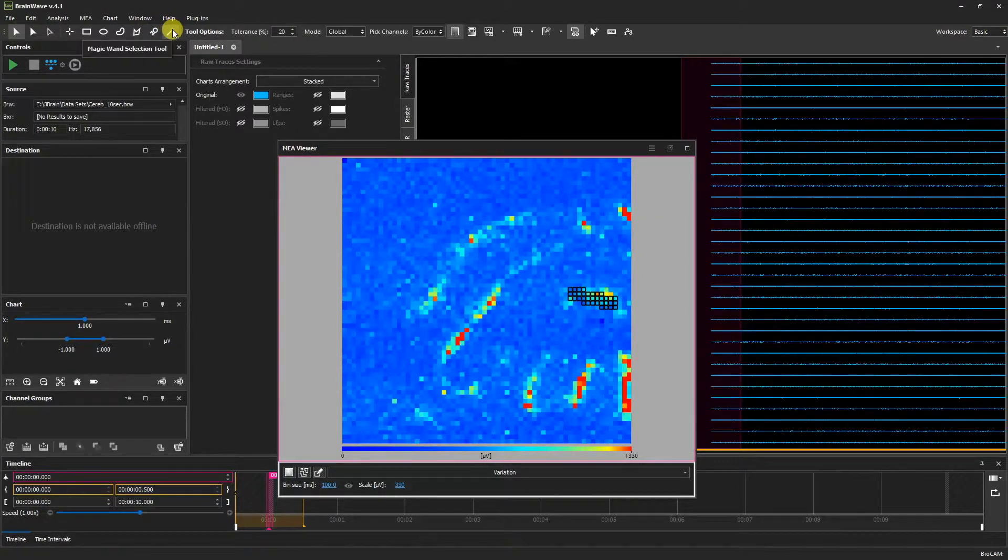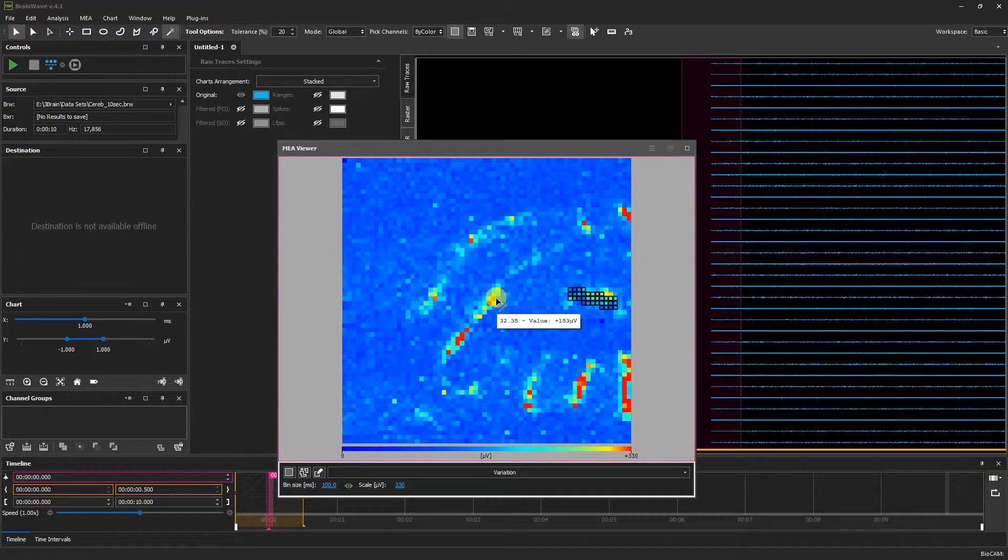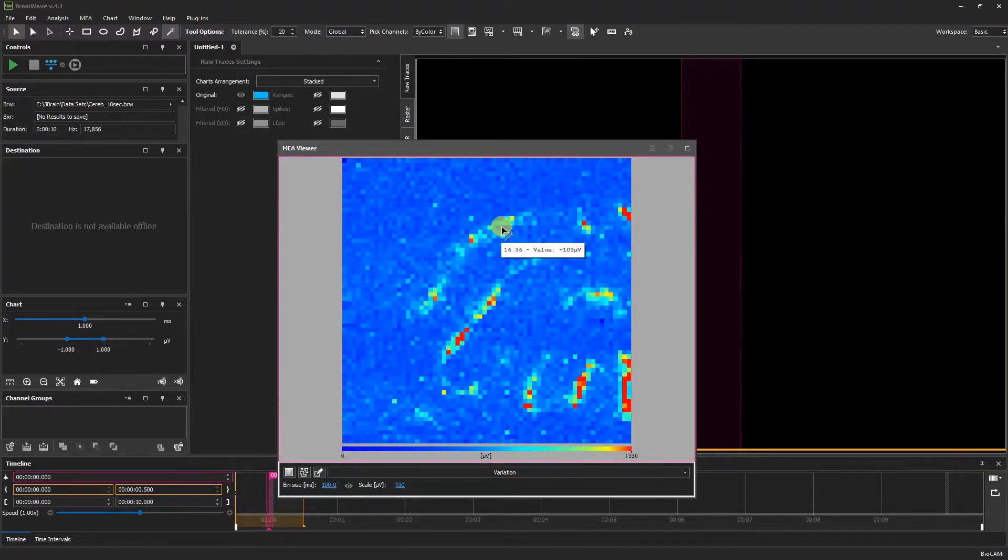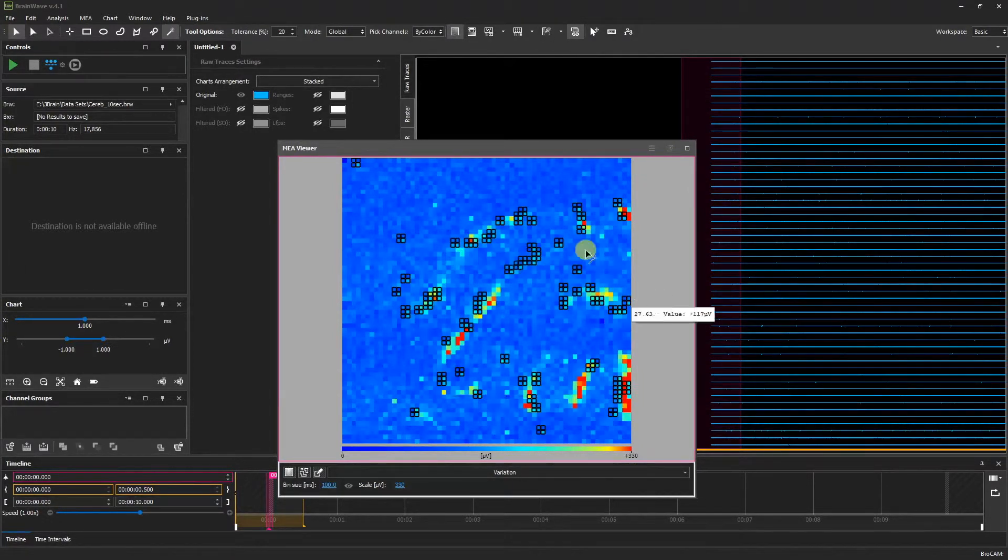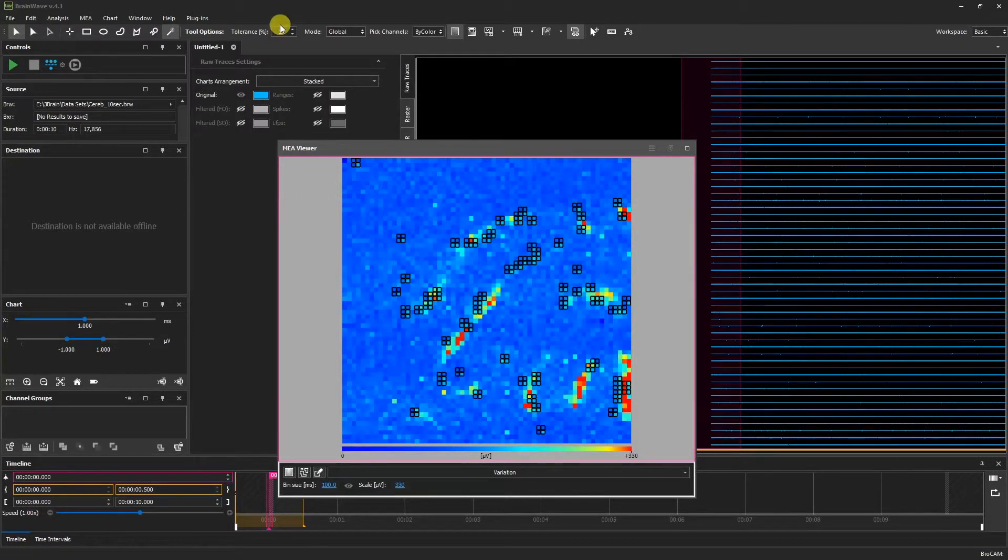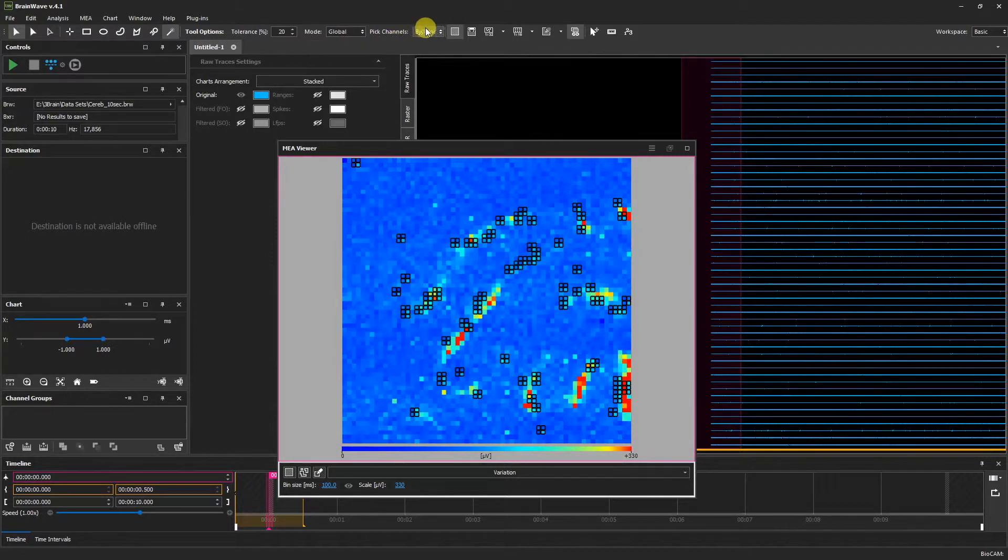Finally, the Magic Wand Selection tool allows you to select pixels with similar features. For instance, if we click here, we can select a variety of pixels all across the channel grid. We can also adjust the tolerance, the mode from global to contiguous, and decide to pick the channels by color or by value.